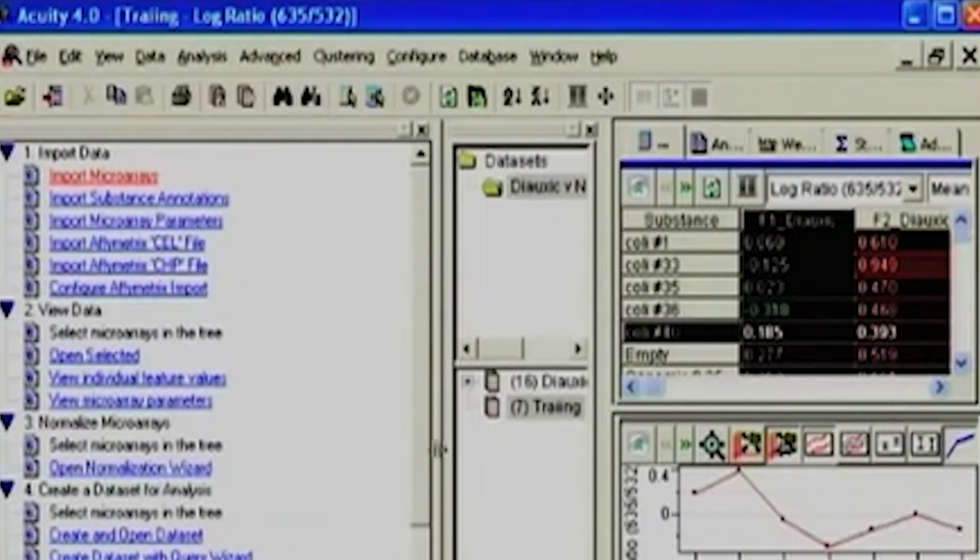I need to make sure that all my chips are normalized similarly. Essentially when I import the data, I prefer it non-normalized, and then I select one base of normalization. I can create the same experiment in different ways with different normalization, and do the further analysis down there. Once we have finished the normalization method, we can look at a query, which creates data sets. As we described, one simple way is to right-click the data, select the chips, and then create a data set. Or you can come here and say create a data set from the open data set.